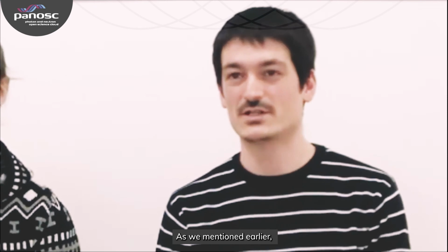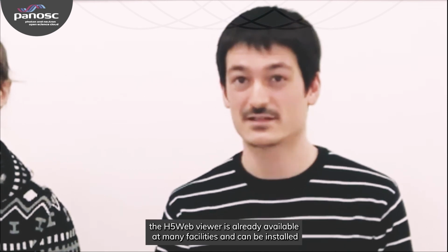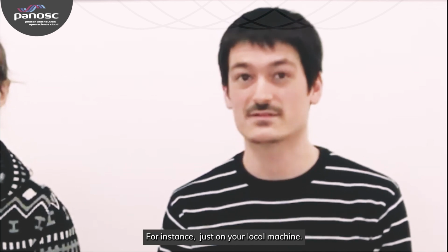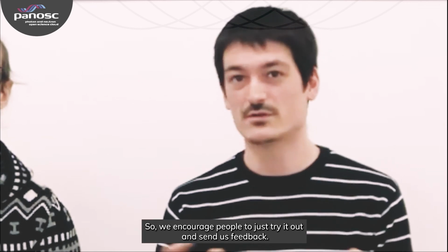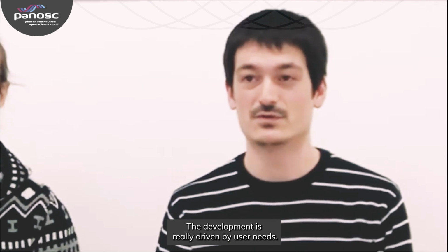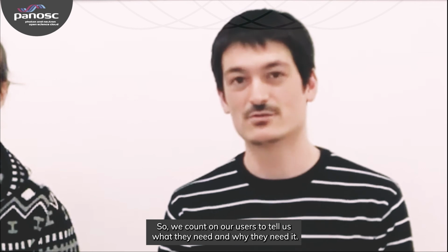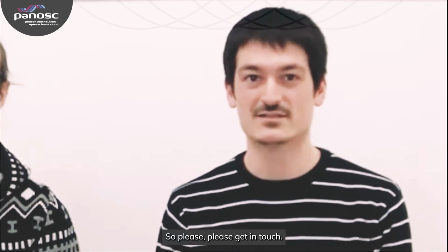As we mentioned earlier, the H5Web viewer is already available at many facilities and can be installed really easily on a local JupyterLab instance, for instance, just on your local machine. So it's free and open source, so we encourage people to just try it out and send us feedback. The development is really driven by user needs, so we count on our users to tell us what they need and why they need it. So please get in touch.